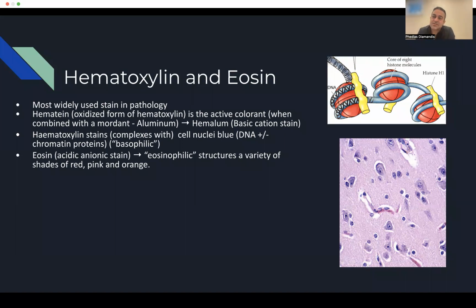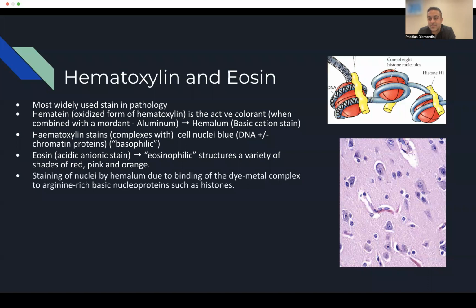So again, it's not just a binary pink and blue stain. There's a spectrum that you usually get between the two, and sometimes the spectrum is because some proteins or amino acids will actually stain with both, and then you're seeing the mixture of the two together.